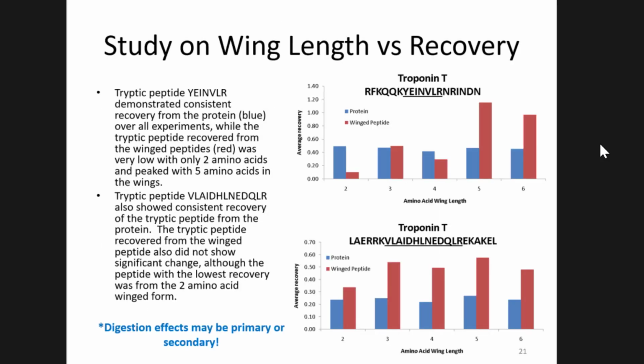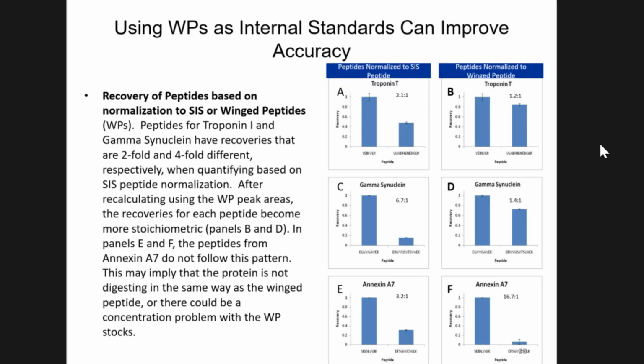Some conditions, so you use quite an aggressive matrix. You use serum, right? Yeah, plasma. Okay, it's almost the same. Did you try another matrix? Is it the same behavior? We did not try another matrix, and it could be completely different behavior.